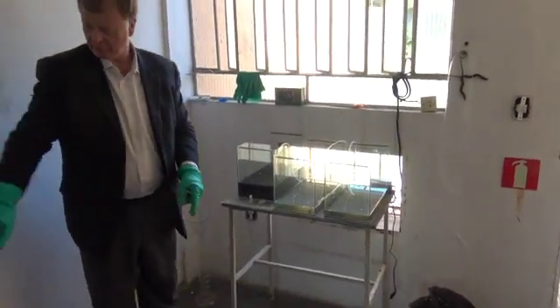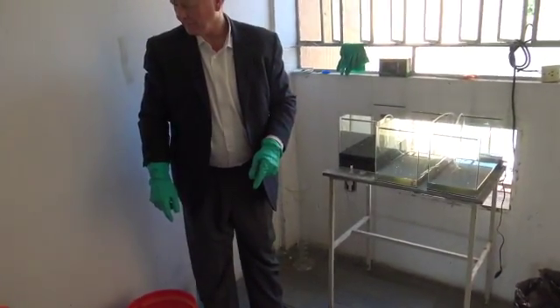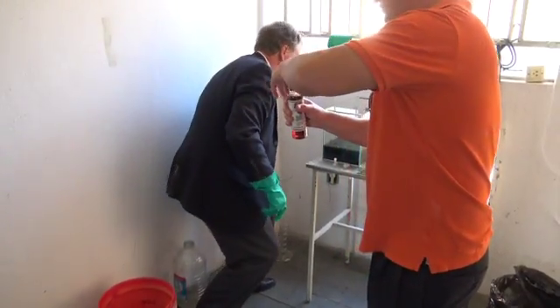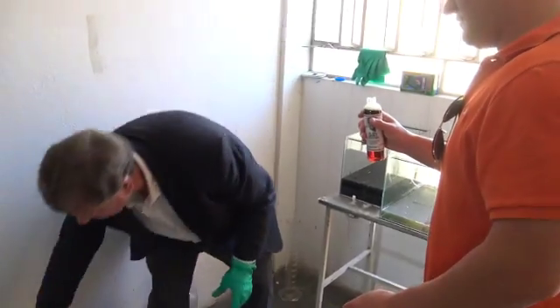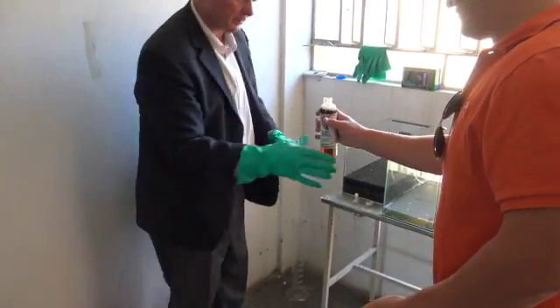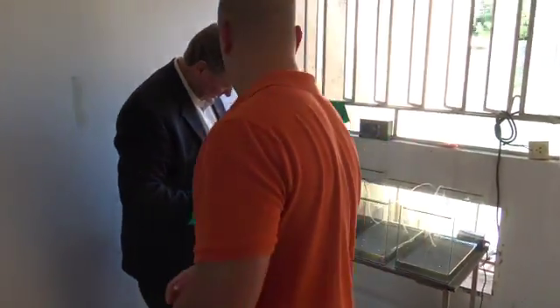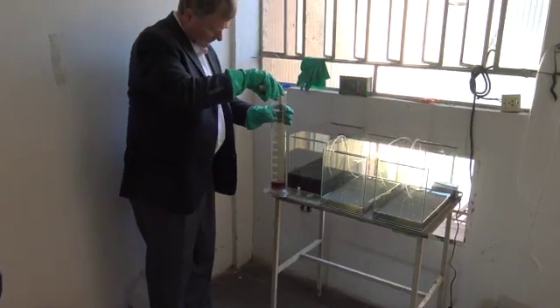Robert, get OSE II. More than one bottle? Oh, yeah. How many? Just get one more ready.